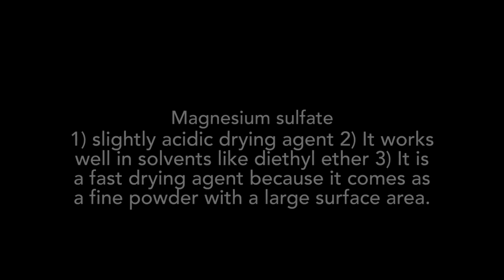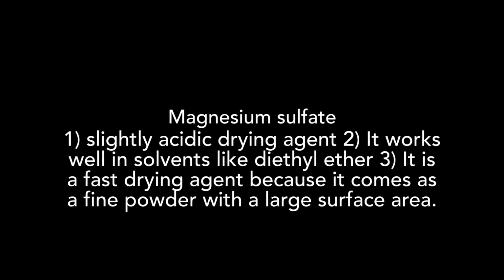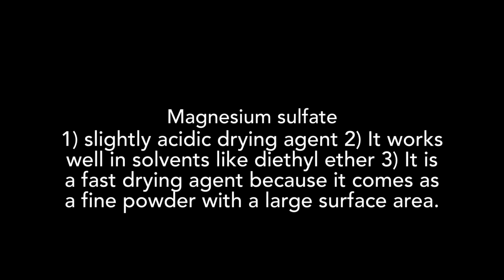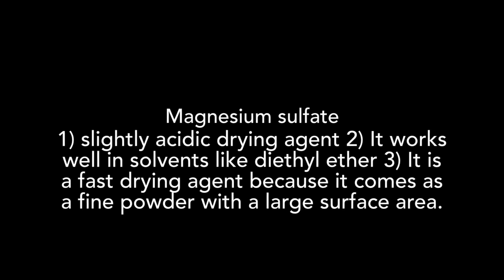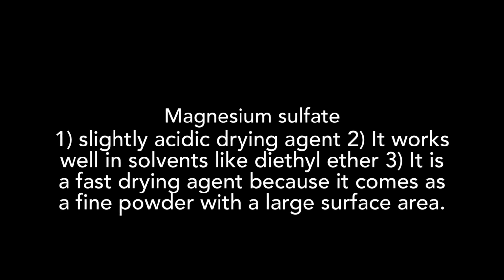We're going to be using magnesium sulfate, and that drying reagent works pretty well with diethyl ether. It's actually a slightly acidic drying reagent and is able to cover a pretty big surface area because of how fine the magnesium sulfate powder is.